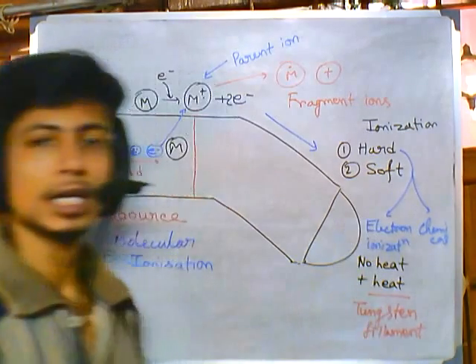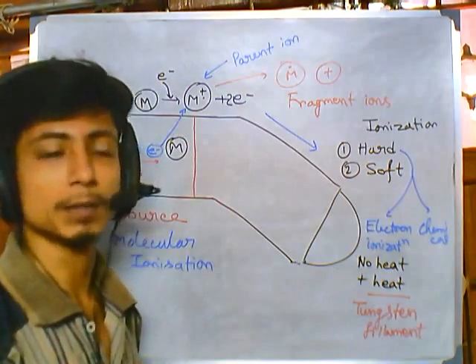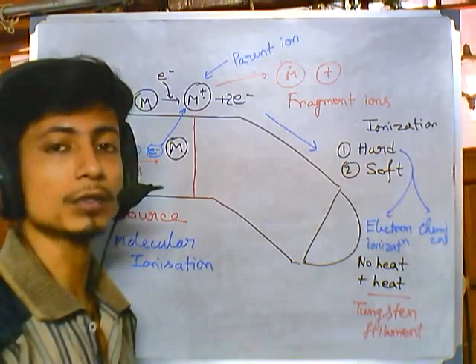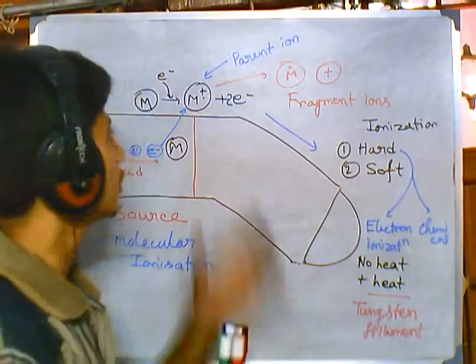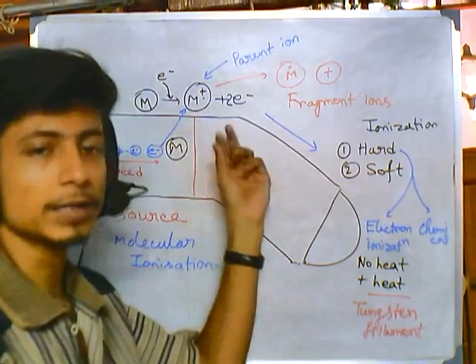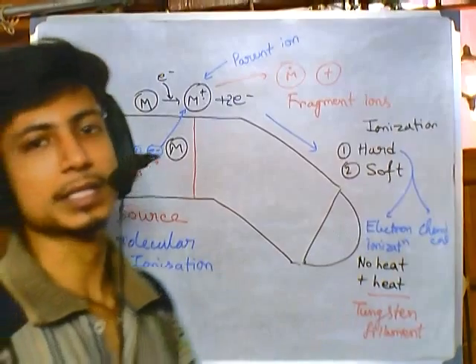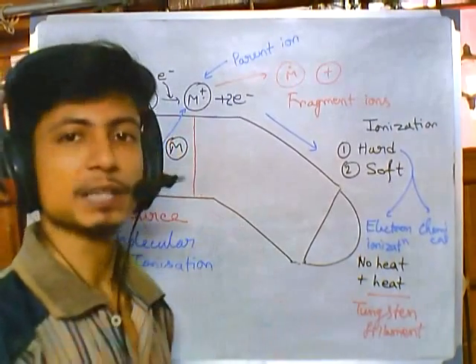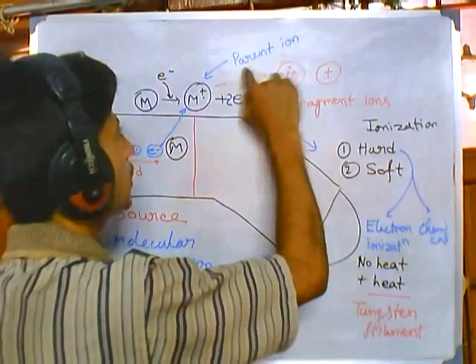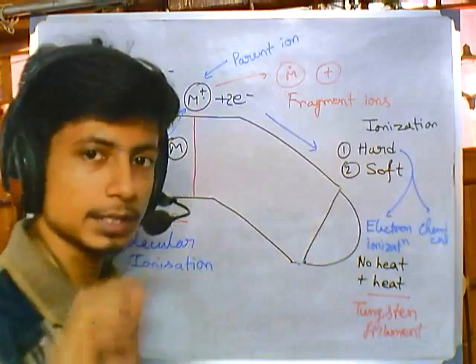Okay, but we can utilize this type of hard ionization in the case of molecules which are chemical compounds, mostly not biological compounds. Actually this hard ionization is utilized for many different chemical compounds and large compounds which can be divided into parent ions. The parent molecular ions generated utilizing this electron ionization technique are not that stable. I'm emphasizing they are pretty unstable. So as we produce these parent ions, they will soon be fragmented into fragment ions. That's the true part.